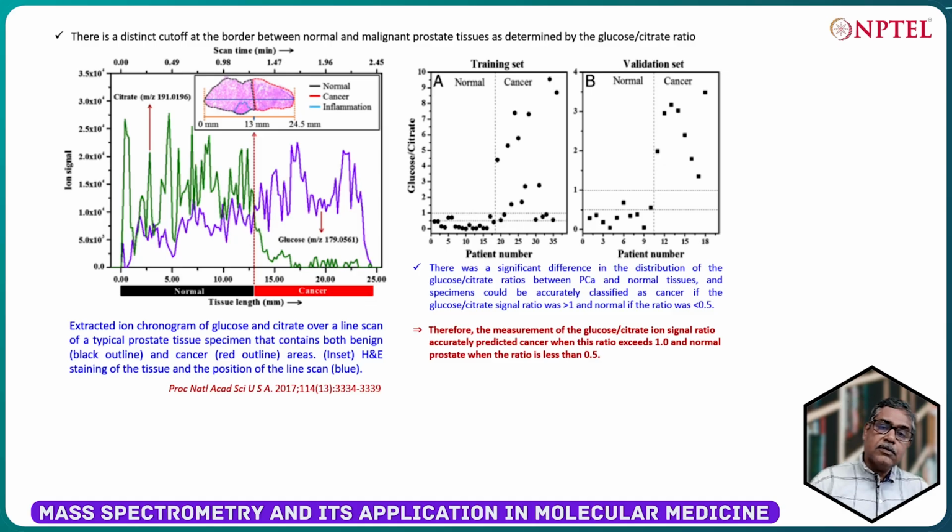So, hopefully this strategy might be used someday in diagnostics to define the surgical margin precisely, once this DESI based imaging is approved by the competent authority for diagnostic use. So, with that, I'll end the discussion on DESI based or mass spec based imaging of biological tissues. I'll end the class here.